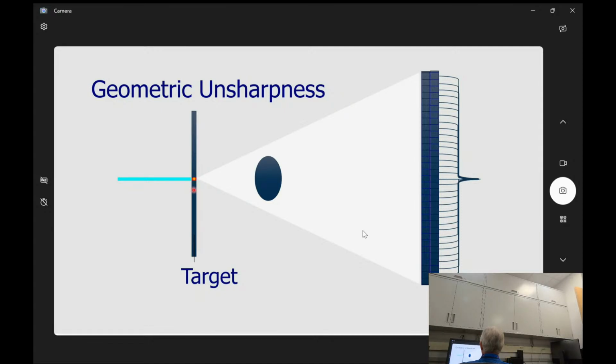What this is illustrated by: if I've got more or less a point source and I've got rays coming from that, a ray can go across an edge, whether it's external or internal in the instrument, and then that falls on a pixel element or two at the most on the detector, so the edges appear to be sharp. Well, if I turn up the power, so that could be higher kV, could be higher current, I'm putting more electrons on a certain spot, and if I keep that spot size the same, I'll probably be burning through the target.